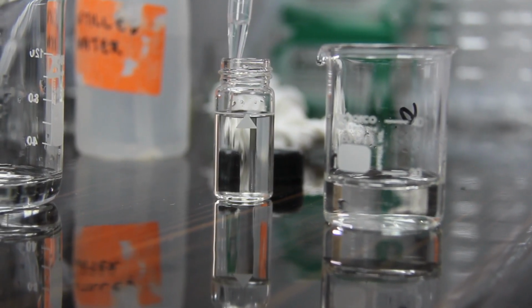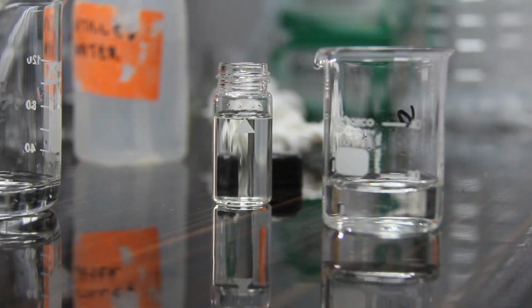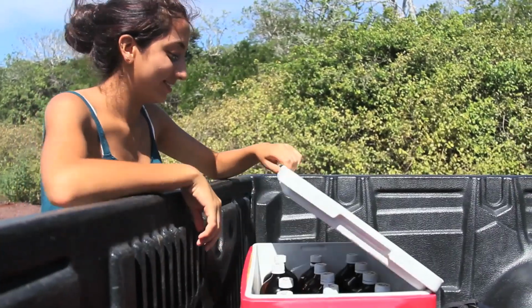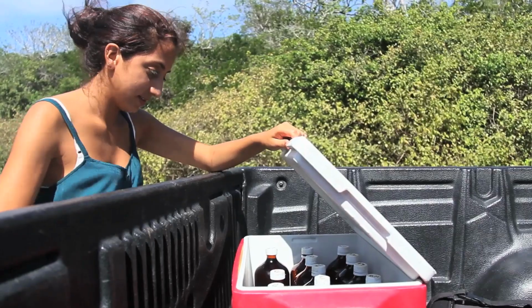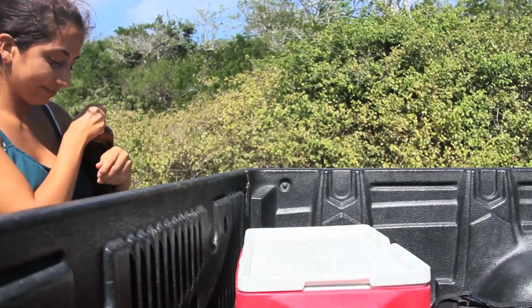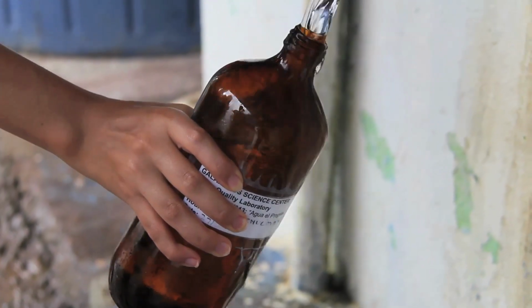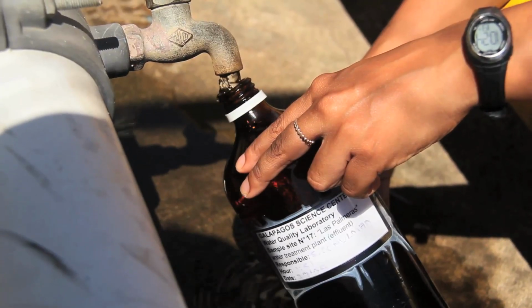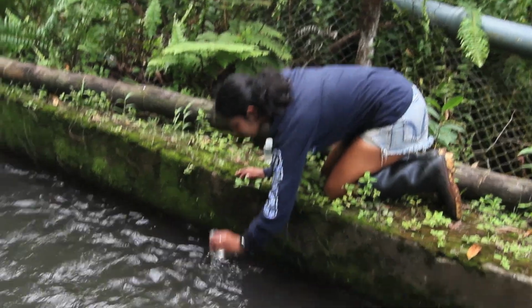Right, so the things that we're measuring are microbes in the water that could be associated with fecal contamination. So we're measuring Enterococcus, which is a standard indicator for water quality, as well as E. coli, that's associated with fecal contamination. Basically, we're going around town and collecting different water samples from treatment plants and different springs and the beaches to see if there's any fecal contamination of the water.